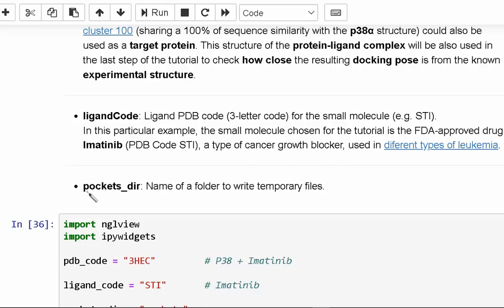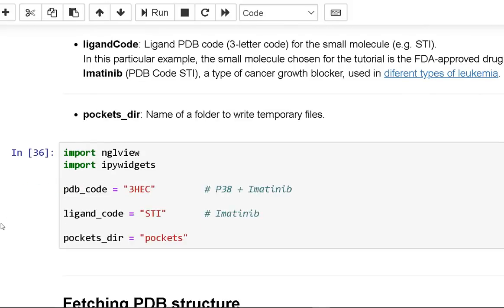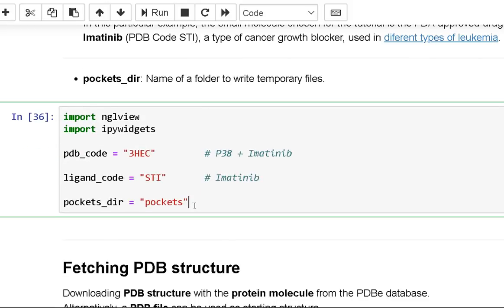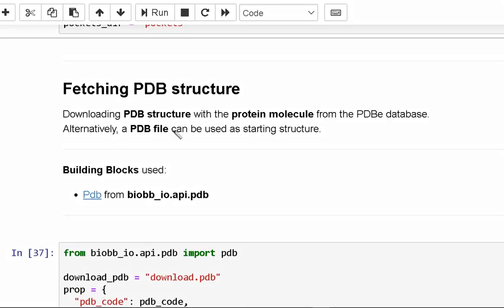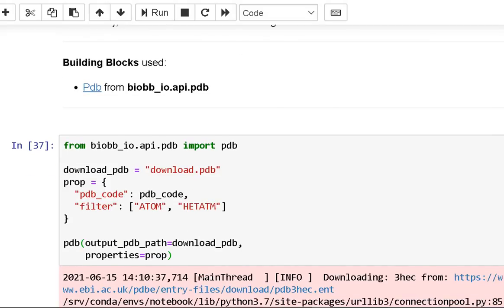The third parameter is the pockets directory — a name of a folder to write temporary files. The second step is fetching the PDB structure. You can download the PDB structure with the protein molecule from the PDB database, or use a PDB file as a starting structure.